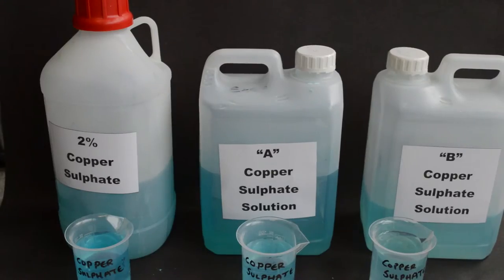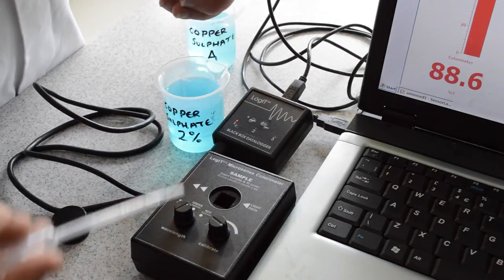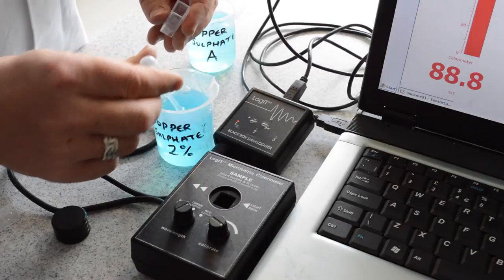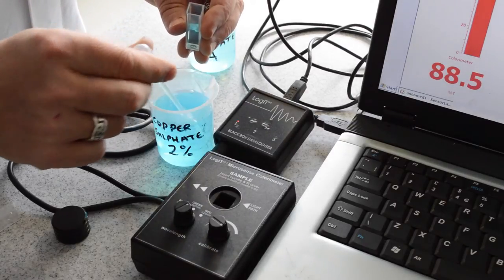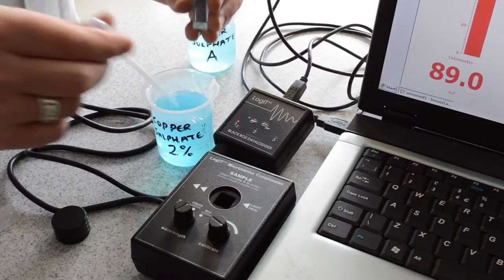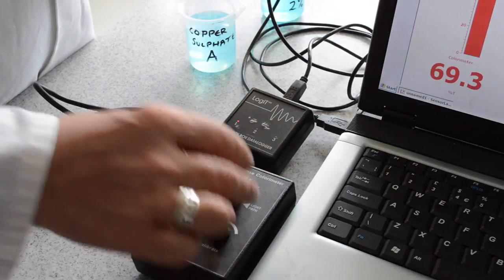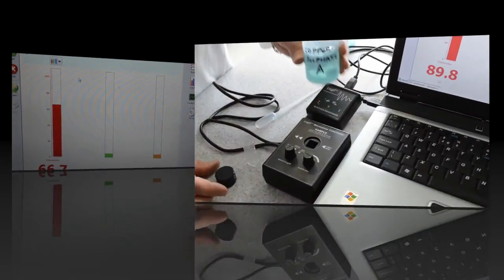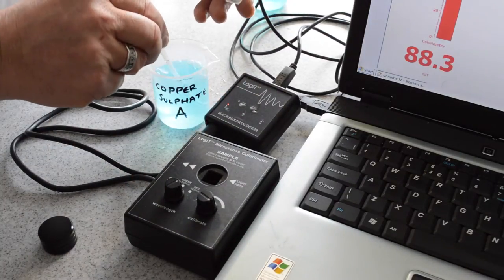In the lab there will be provided copper sulfate solutions at two percent, and a sample of copper sulfate and a B sample of copper sulfate which are unknowns. Place the standard solution of two percent copper sulfate into a cuvette, then place the cuvette into the colorimeter and top with the cap. Notice the value on screen for the known solution. Repeat the process using sample A and sample B to determine their values.